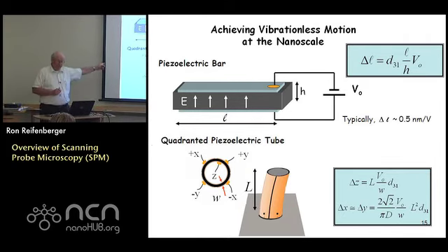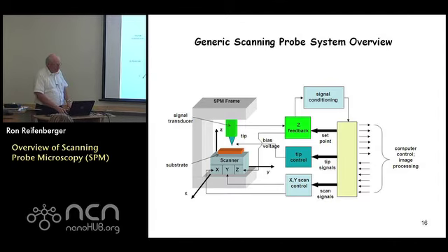And this is a key feature in all scanning probe microscopes. This is what they did in the early days, 1981, 82, and it's still used today. So this piezoelectricity is a really cool thing.